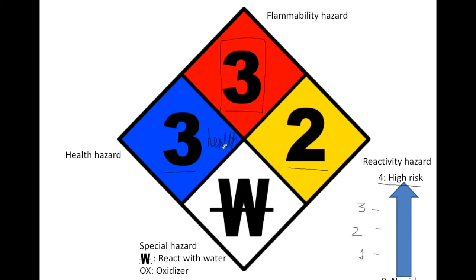So the health hazard is about 3, which is pretty dangerous, and it's also very flammable. Flammability means if it burns easily or not. In this case, it'll burn very easily. Well, not extremely easily, but normally easily, because it has a 3 here.